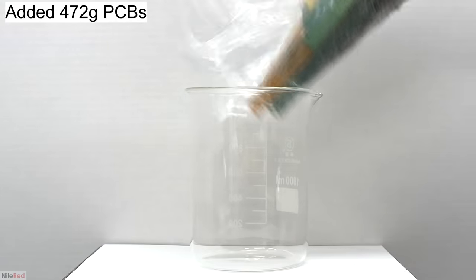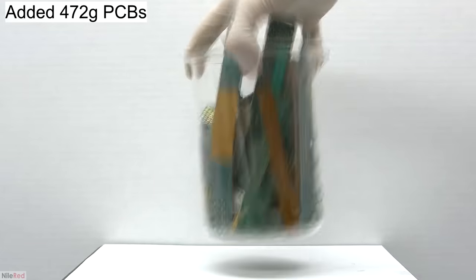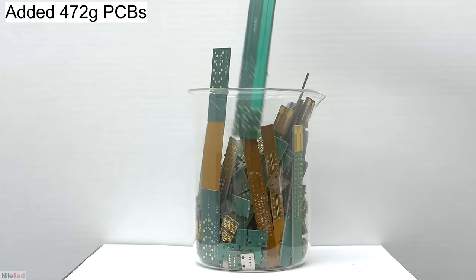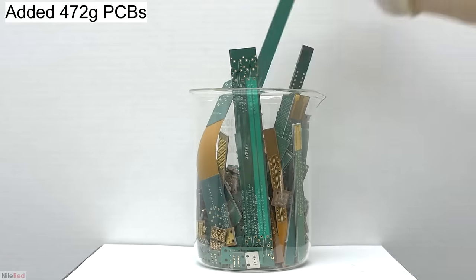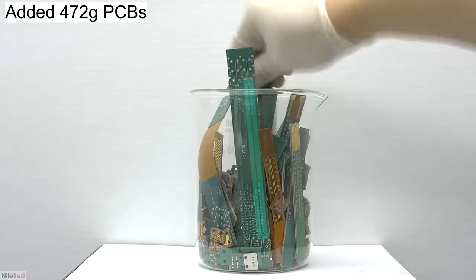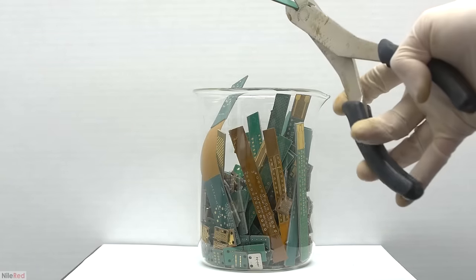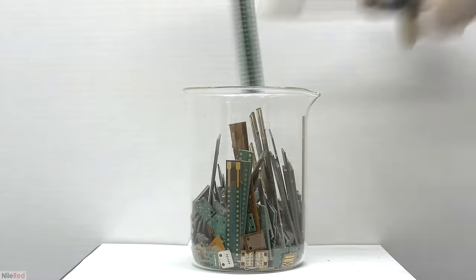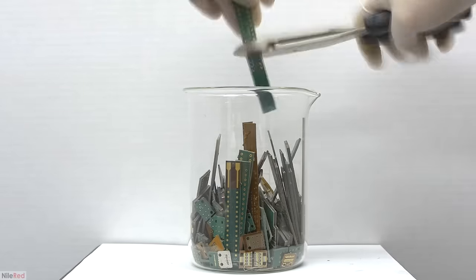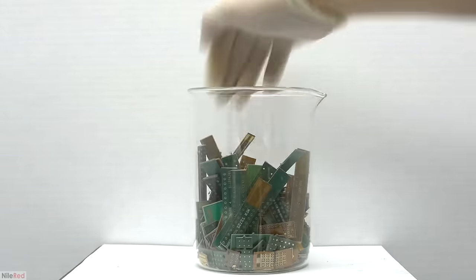To start things off, I add the first batch of computer boards to a one-liter beaker. Before adding it, I weighed everything — it was advertised to be about a pound, and it actually came out to be a little bit more at around 472 grams. It's pretty easy to see that some of the boards are too long for the beaker, so we're going to have to cut some things. Most of the long pieces only had gold at each end, so I simply cut off the ends and discarded the middle part. Some longer pieces had gold over the whole length, so I just cut them in half and saved everything.